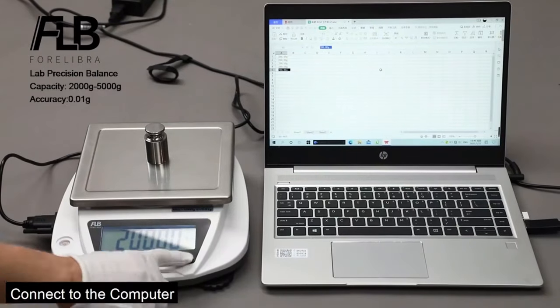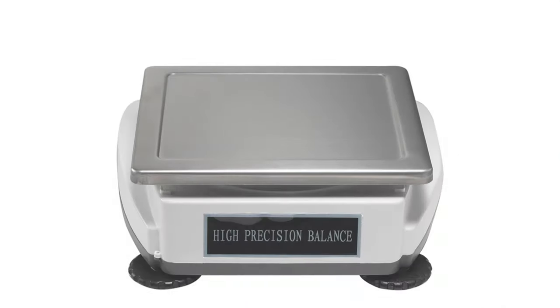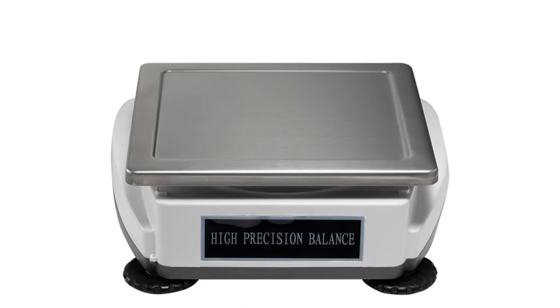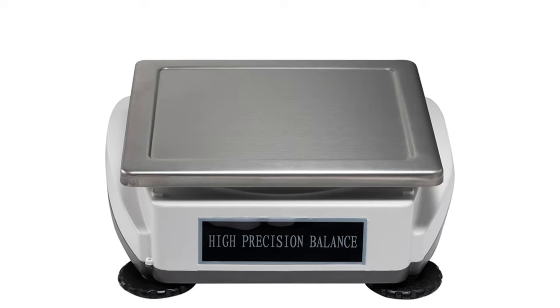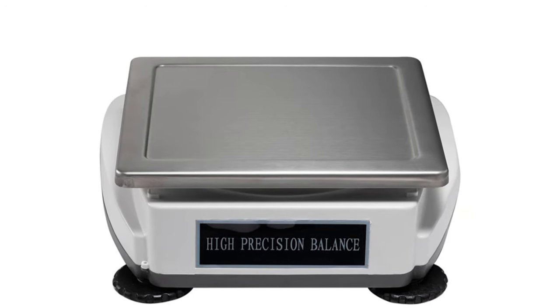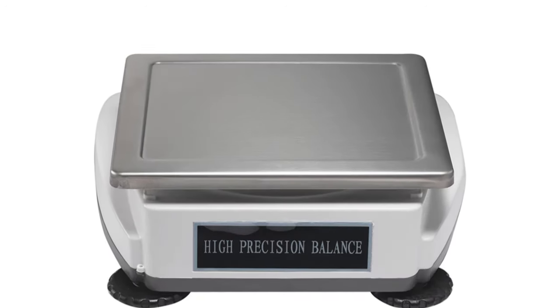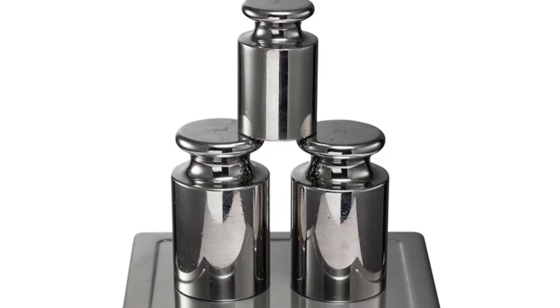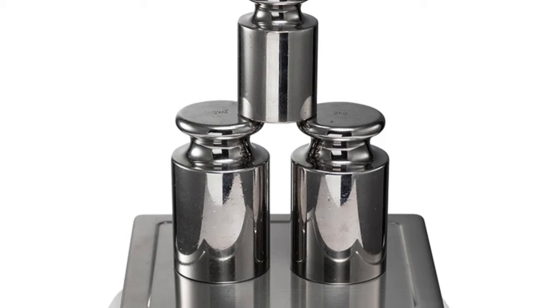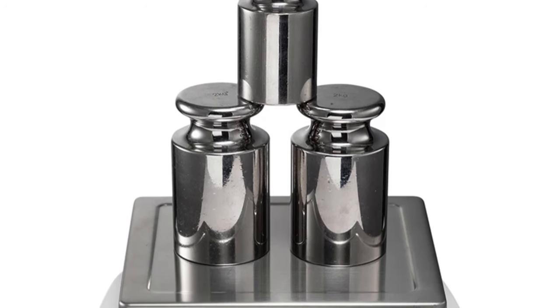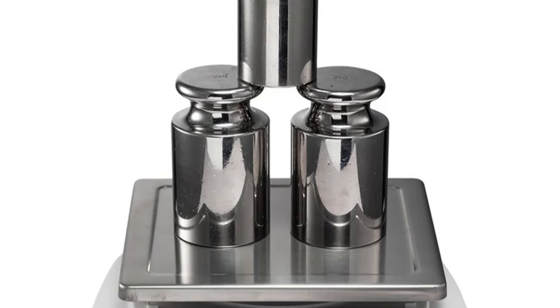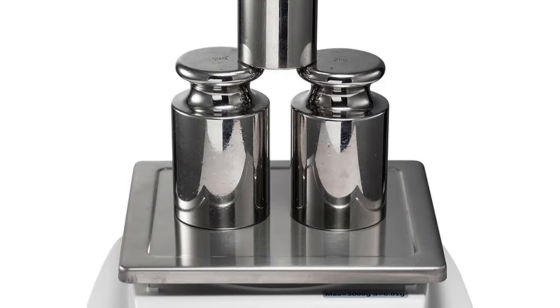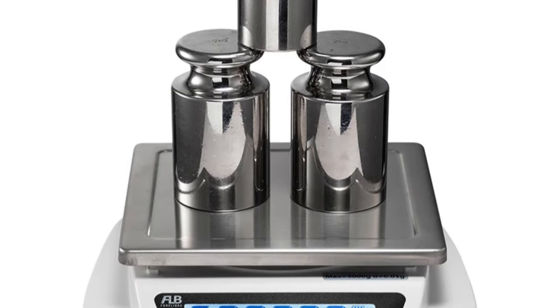The digital precision ensures ease of use and accurate readings. The electronic weight scale adapts to various needs, from small-scale kitchen measurements to more extensive laboratory applications. The FLB4 Libra Analytical Balance is a durable kitchen appliance with a robust build, making it a wise investment for both professional and home use. The brand's commitment to excellence is evident in the construction and performance of this analytical balance.